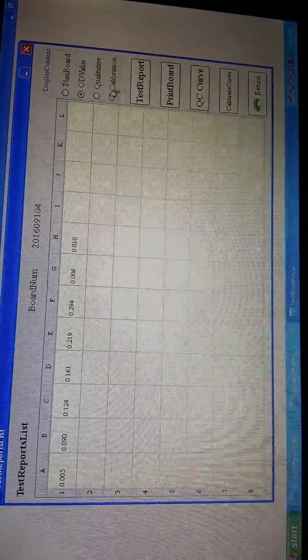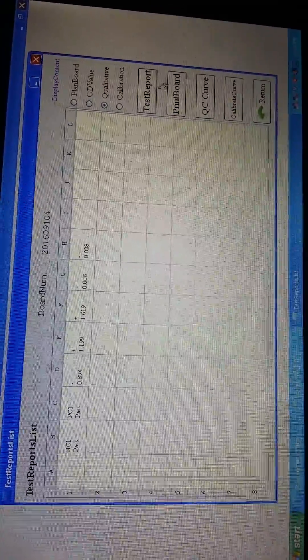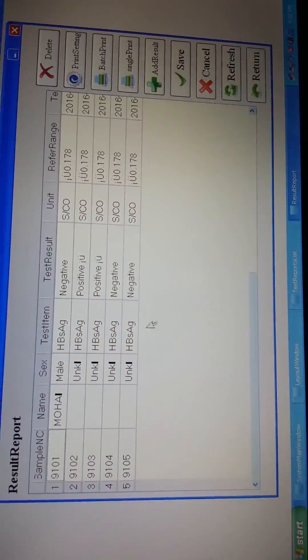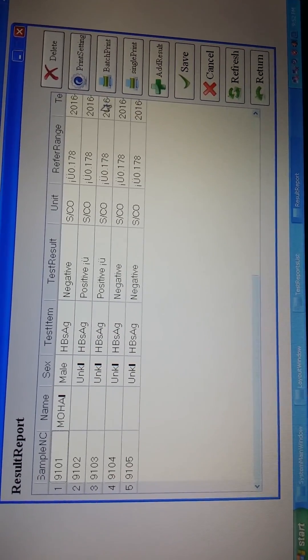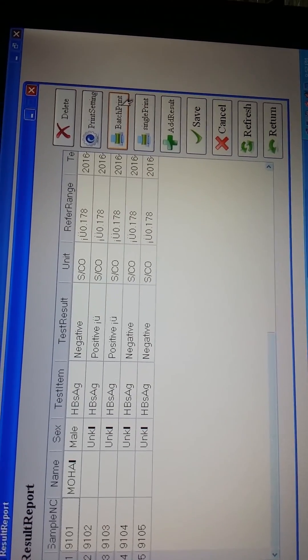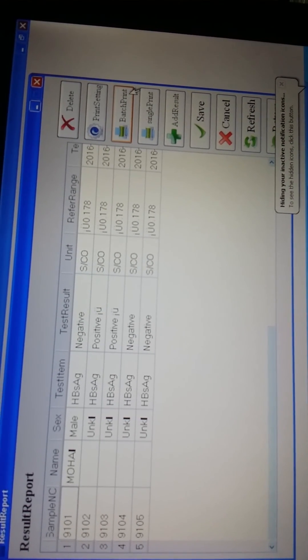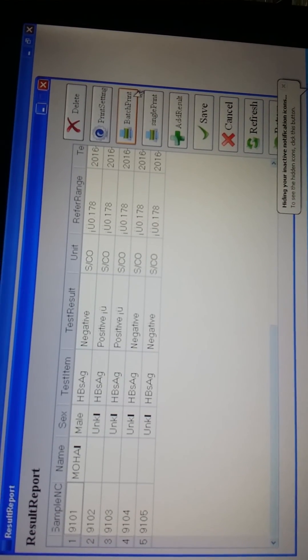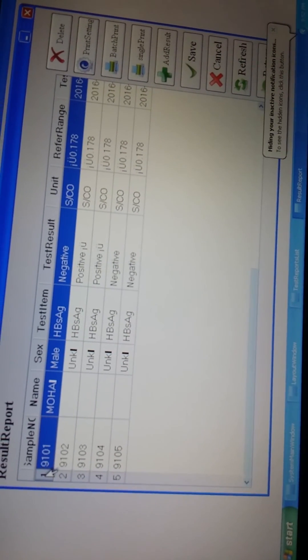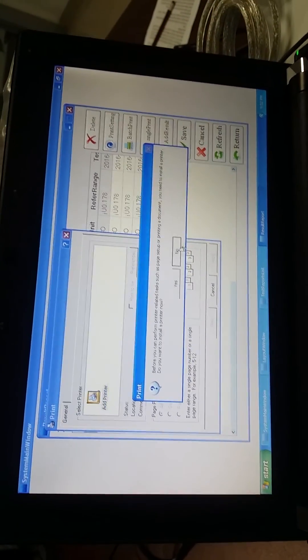Now we select the qualitative result. Here are the results, and we press the test reports to view them. If we want to print out the results, there are two print options: batch print and single print. If we choose batch print, you can print multiple results at one time. If we choose single print, you print them one by one. We select and press print, then the results will be printed out.